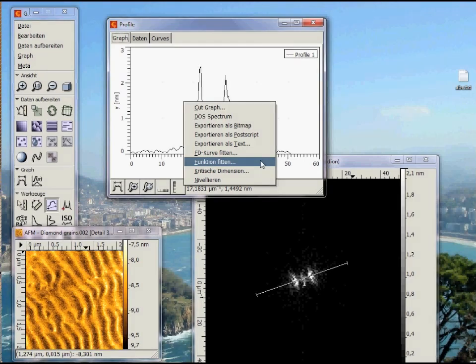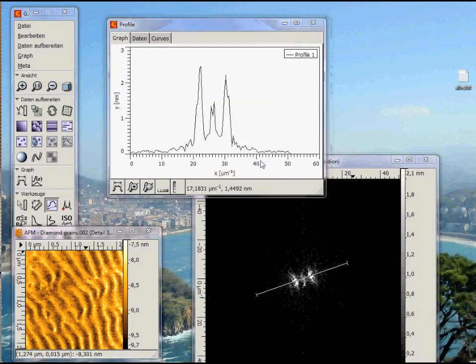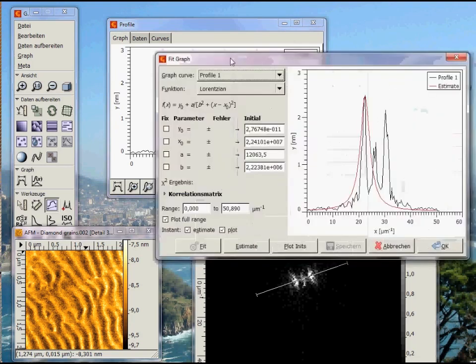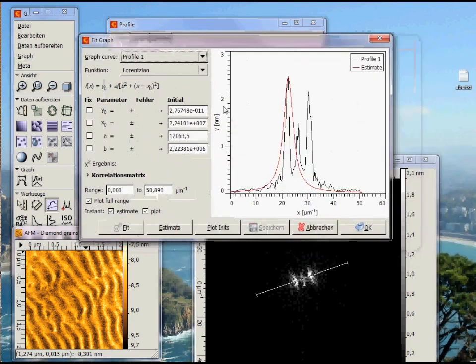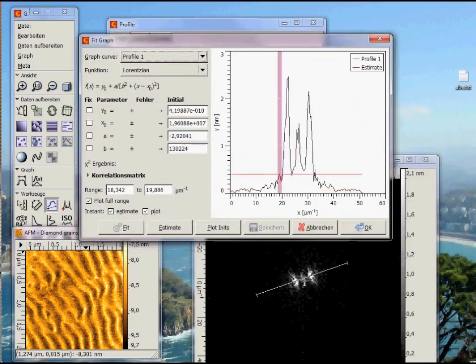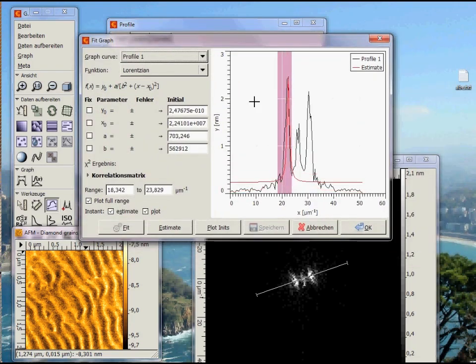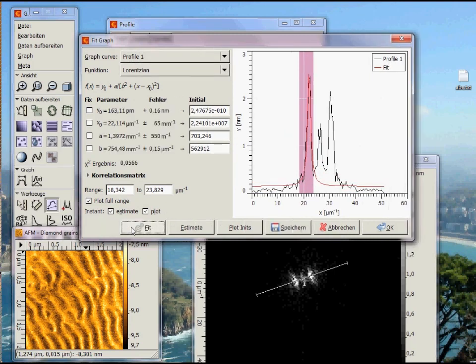So we go on function fitting. Select the first peak and fit. For x0, that means the lateral peak position, we get 22.11 microns to the minus 1.